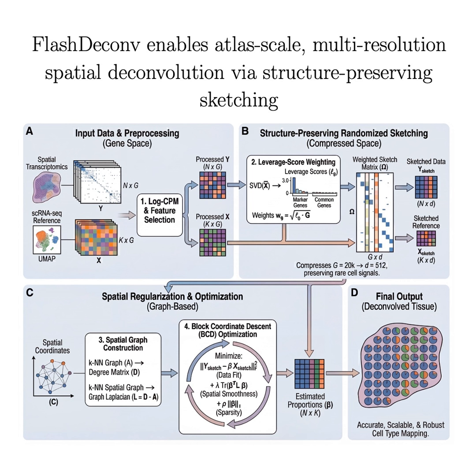55 microns, because of computational limits, if they've already published their findings, here's the provocative thought we'll leave you with. I like this. What other crucial cell interactions that we currently assume are positive collaborations because the low resolution mixes their signals, what if they're actually critical mutual exclusions that we are only now, thanks to this new speed and precision, just starting to resolve?